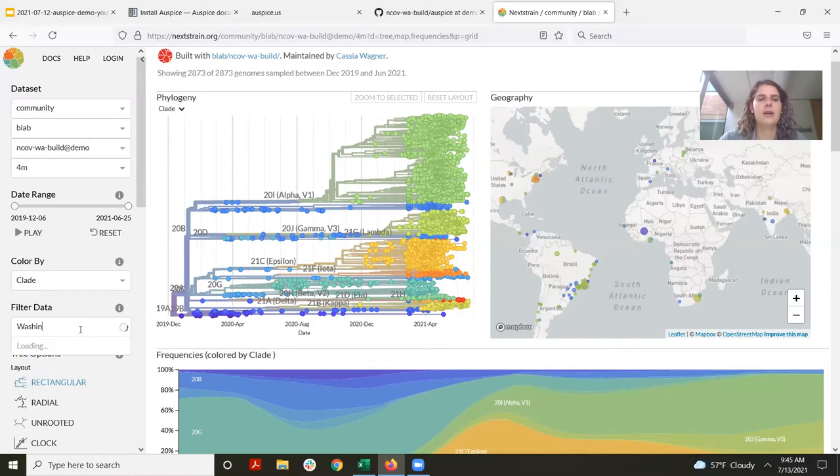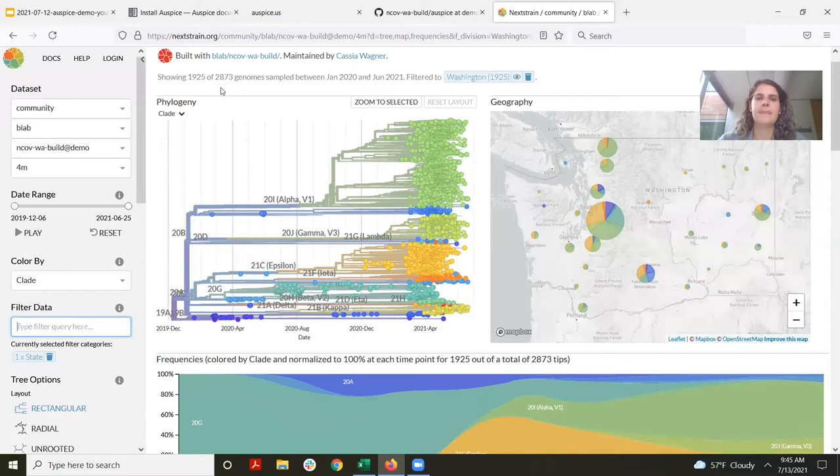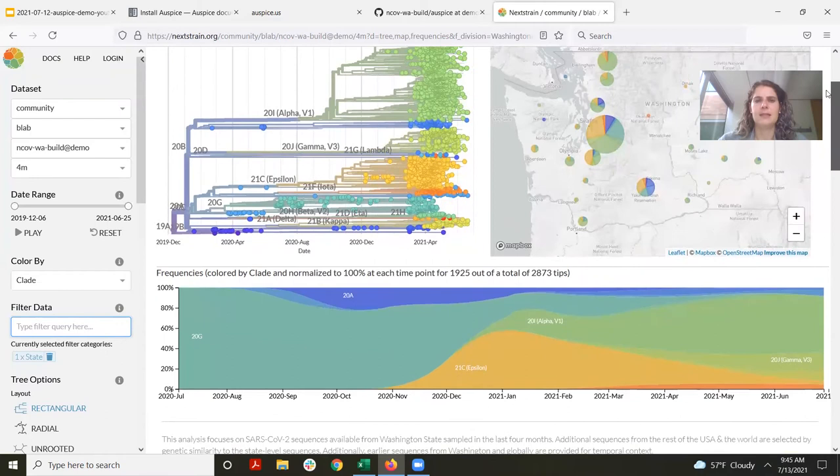To do that, I can just type Washington in this text entry box and select state Washington. This has now filtered my tree and my map to only show samples from Washington state — we have just over 1,900 samples. Additionally, the frequency panel is now updated as well.